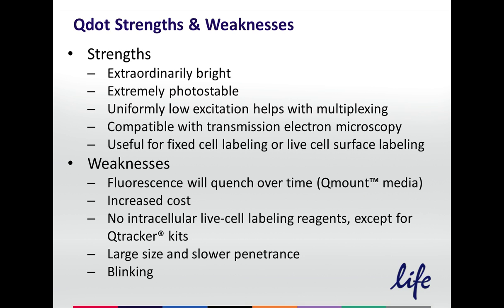Now, of course, Q dots and organic dyes like Fluor dyes do have different properties. There's no one mounting medium that is optimal for all of them on the same sample. So Q-mount, for instance, will preserve a Q dot signal, but it really doesn't do much in terms of an anti-fade for organic dyes. Hopefully in the future there will be some mountant that will work with all of those. So far, not so lucky. So what are the Q dot strengths and weaknesses? The strengths are, as I mentioned, they're extraordinarily bright.